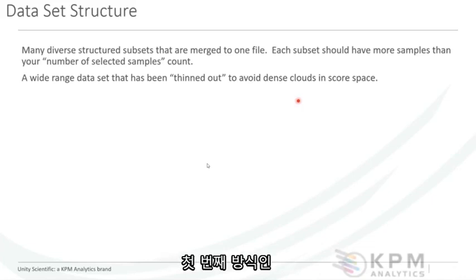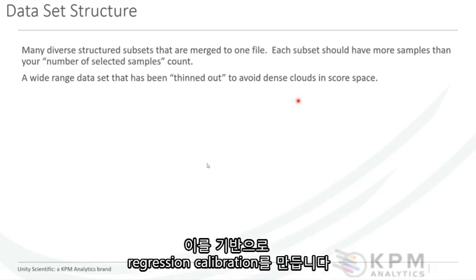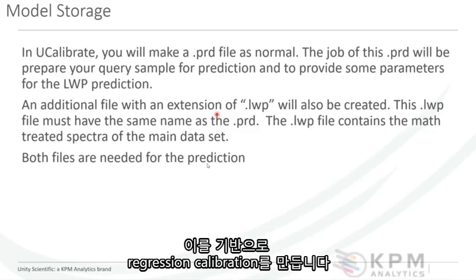I haven't brought it up until now, but this is the ultimate expression of a spectra-first approach. It is actually using the spectra to determine the calibration samples in a dynamic way, pulling those samples out and making a regression, a calibration based on them, okay?